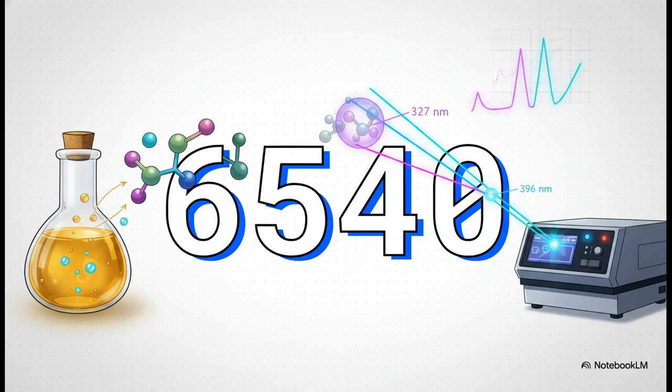Now, the analytical researchers deliberately chose to measure this absorbance at the 396 nanometer wavelength. Why that exact spot on the spectrum? Well, the complex actually peaks a bit higher at 327 nanometers, but the uncomplexed, leftover, free MSE ligand heavily interferes at that lower wavelength. But shift up to 396 nanometers, and the free nickel and the unbound ligand become essentially invisible, giving us a pristine, completely interference-free reading of just our successfully captured target. It's an absolutely brilliant exploitation of spectrophotometric principles.